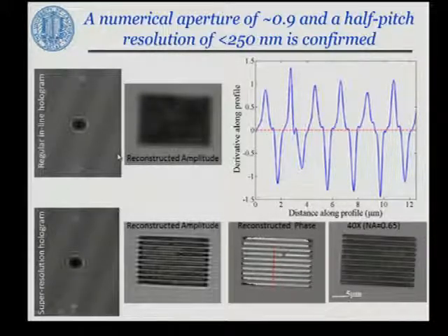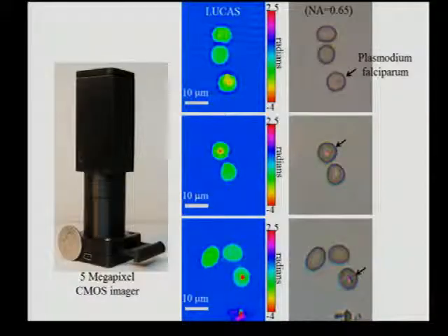It's a 5 megapixel imager, which I believe none of your cell phones currently have. A single reconstruction would not yield the resolution that you demand, but with pixel super resolution, you can reconstruct both amplitude and phase of these objects. And you can still put this together in a field portable design.